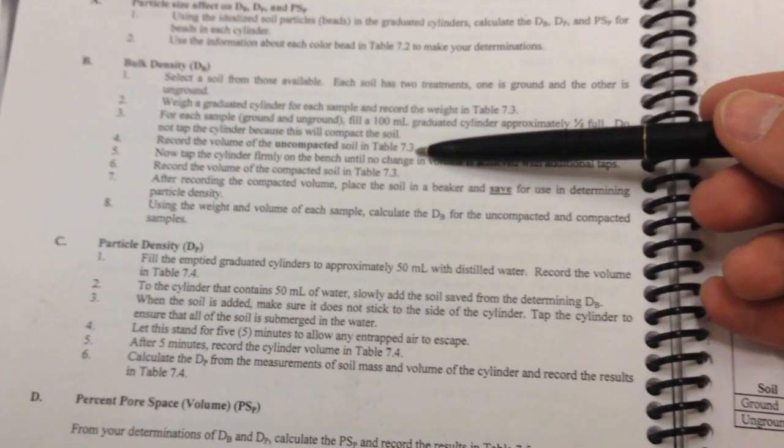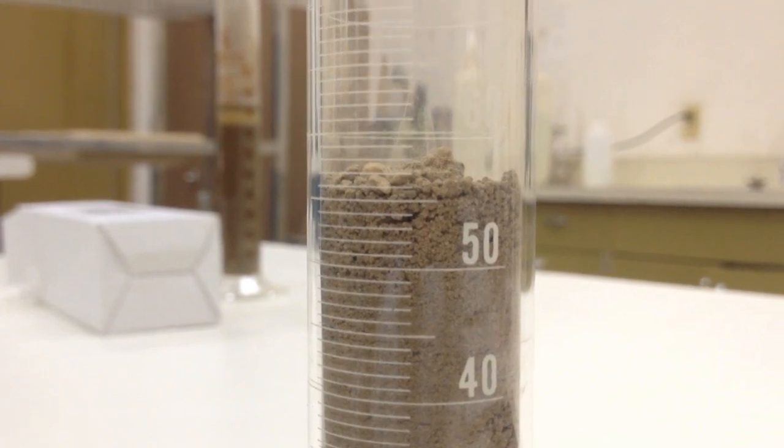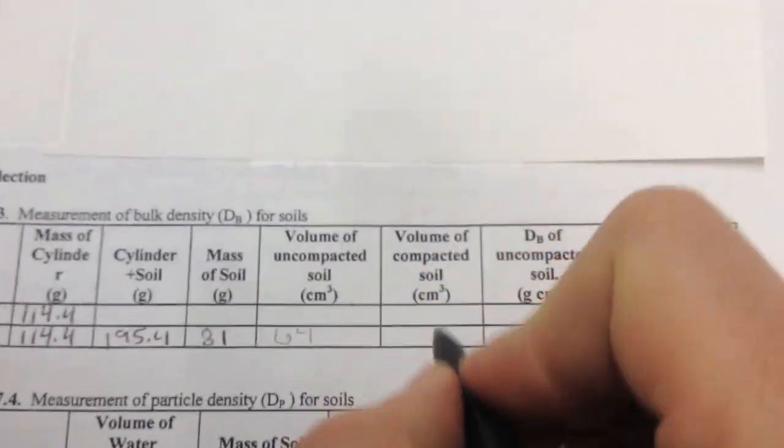So we've weighed the cylinder, filled it half full, recorded the volume, and recorded the weight. Now we're going to lightly tap the cylinder — tap it on something soft like a book, not concrete — to compact the soil. We're taking out some of the pore spaces to see what happens when compacted. We were at 64 before; now after tapping, we're at about 57. So the volume of compacted soil is 57 cubic centimeters.